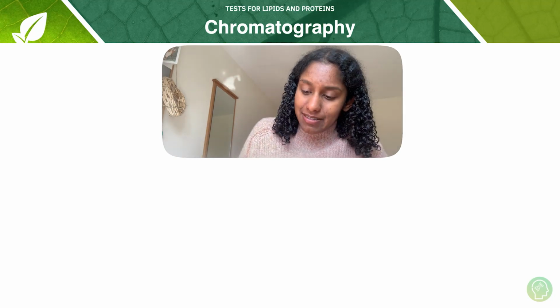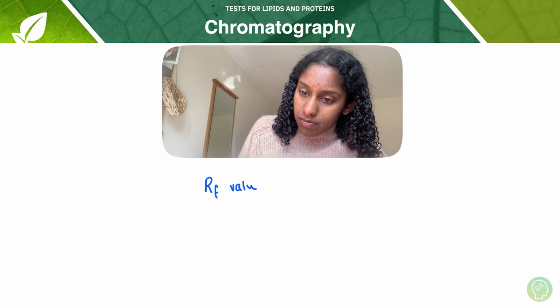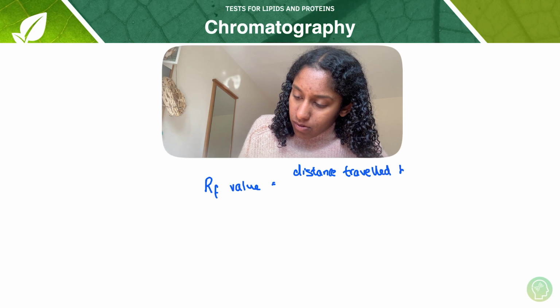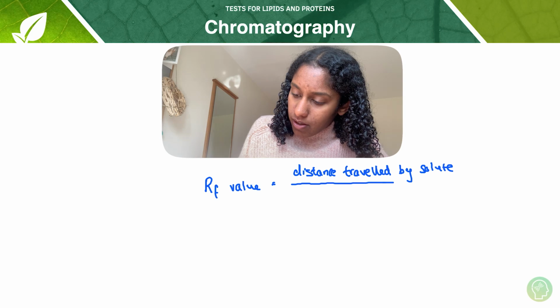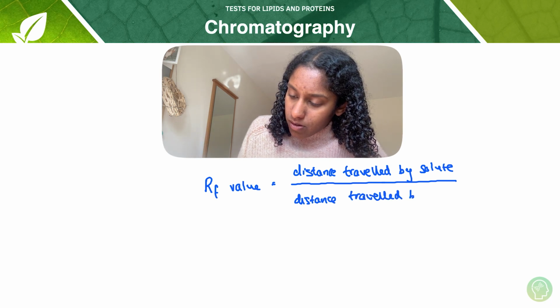So it is RF value equals distance travelled by the solute over distance travelled by the solvent.